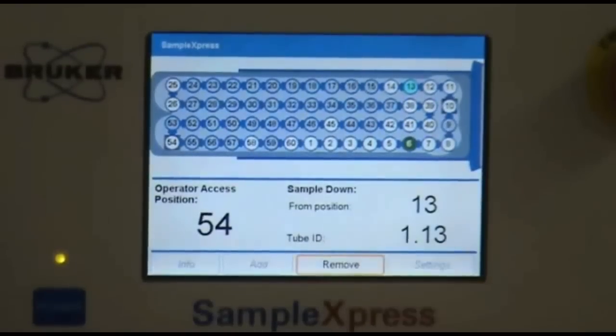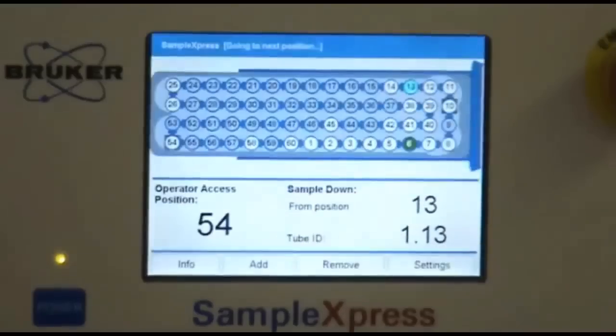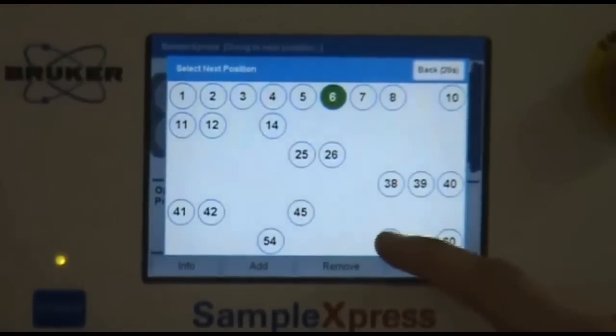To remove your sample, press remove, go to position, and then the corresponding position.